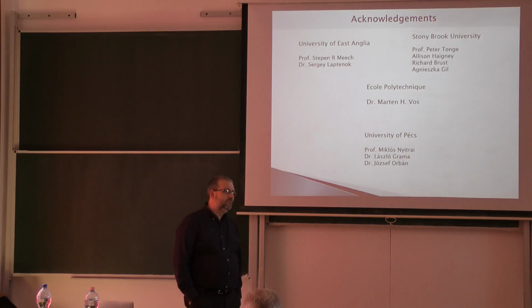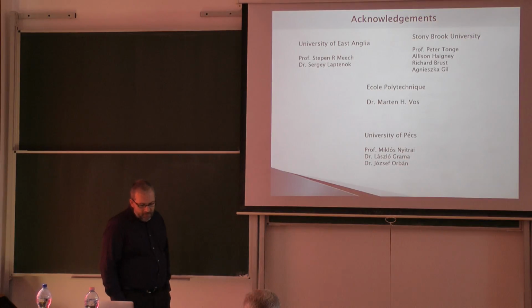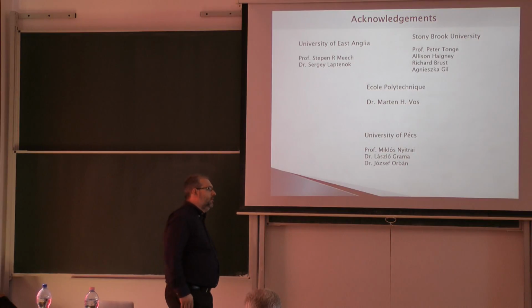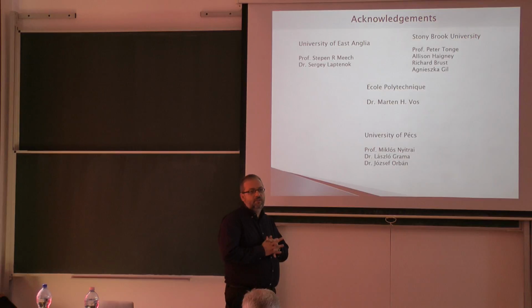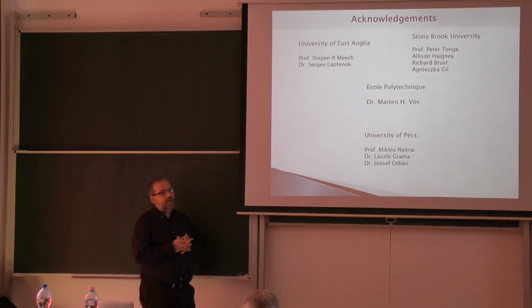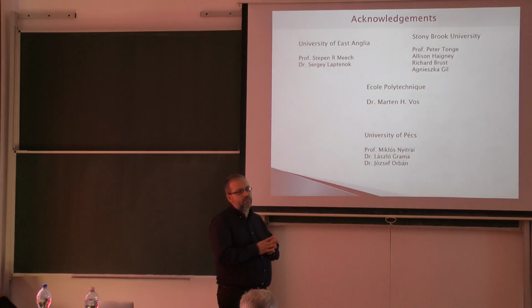And recognition of spectrum, how is that done? Do you match patterns, or do you look via, let's say, an FFT? Basically, it depends on the situation. In the visible and also in the infrared, you match patterns. We have some test samples, or very known molecules, and we are comparing them. Infrared is more complicated, I would say. So we always start with a known sample, with known vibrations, but we are not really using FFT, or not at all, basically.